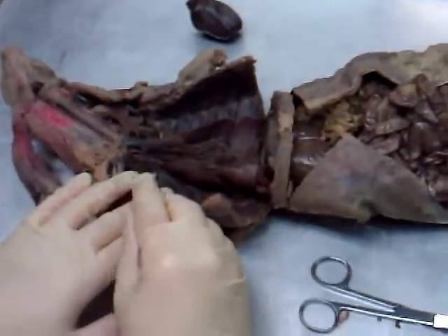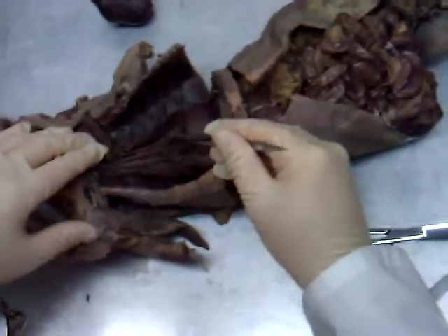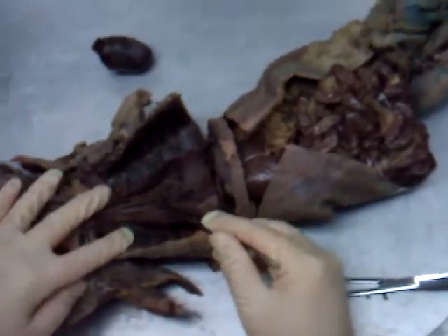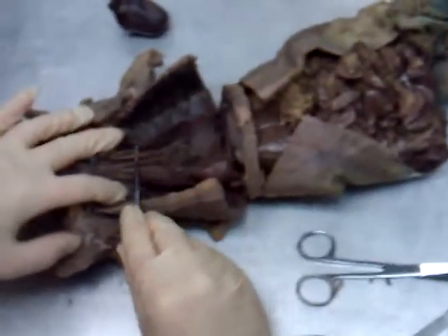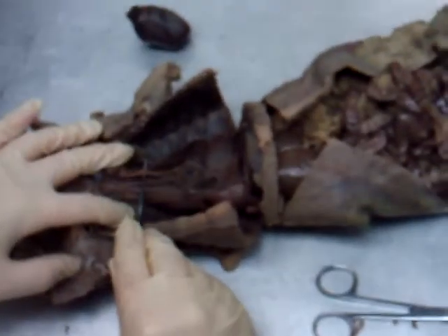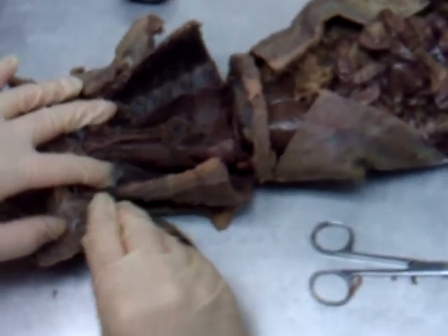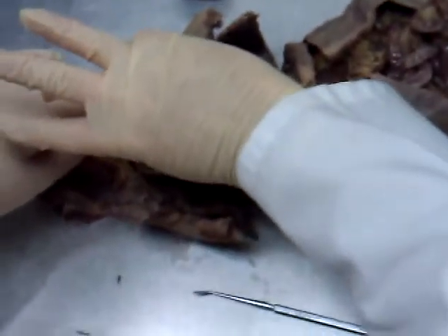Speaking of big veins, this big vein right here was the superior vena cava. Down here is the mink's aortic arch, cut right in there. Coming off the aortic arch there were two big blood vessels. On the mink's left-hand side, right here, this is the left subclavian artery. On the mink's right-hand side, this is the brachiocephalic trunk, which branched into three arteries like a bird's foot.